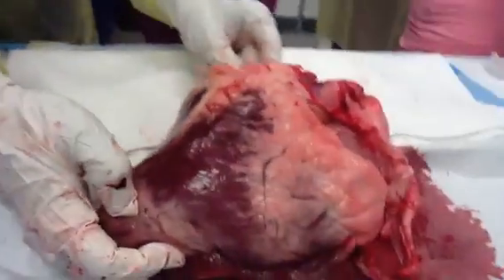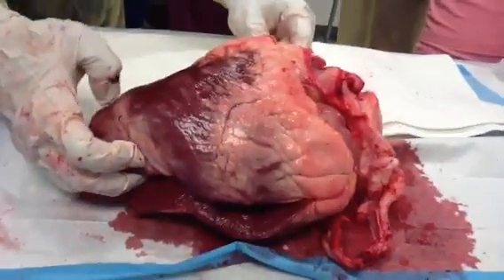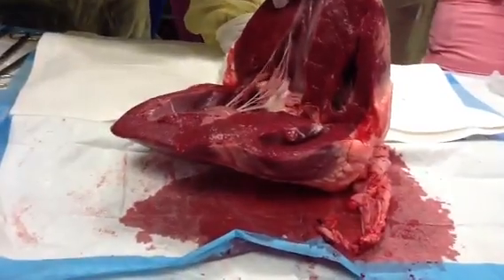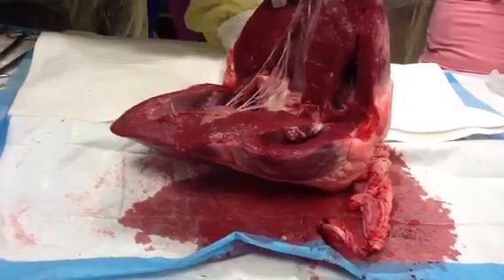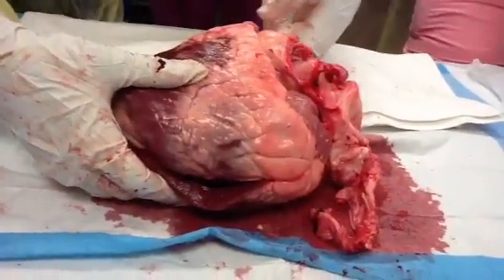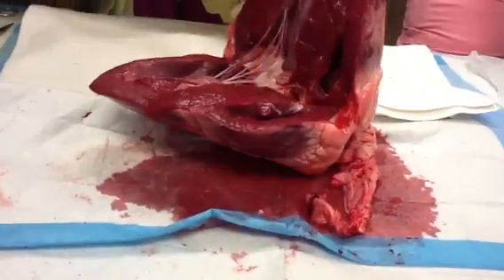Look at that. Rawr! This would be your left atrium right here coming in. That's your right — that's your superior vena cava. Well, I flipped it around. So it's coming right through.